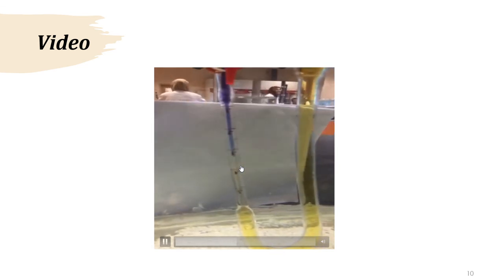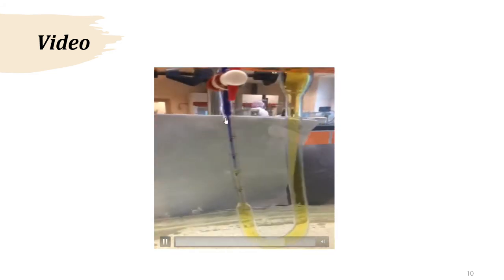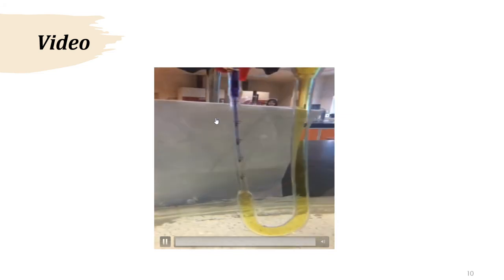One of the tricks of this experiment is to make sure that there are no air bubbles in this cell that can complicate this experiment such that it's not going to move. You don't see that moving boundary. You don't see any movement of the boundary.